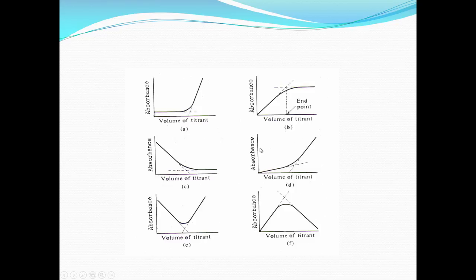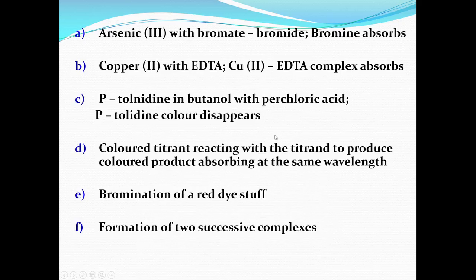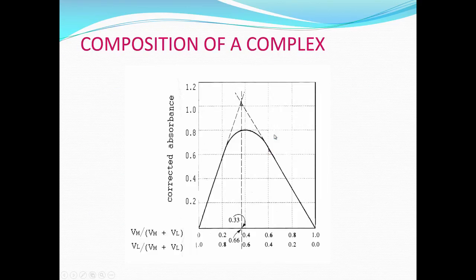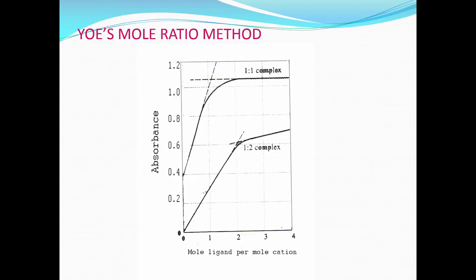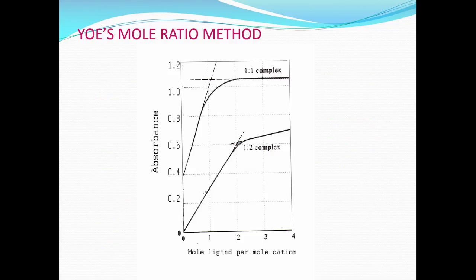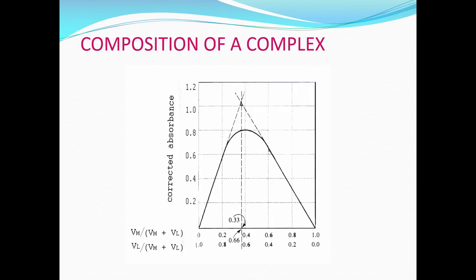And then we will look at the other two methods for the composition of a complex, that is Yoe's mole ratio method, and this is the Job's method.